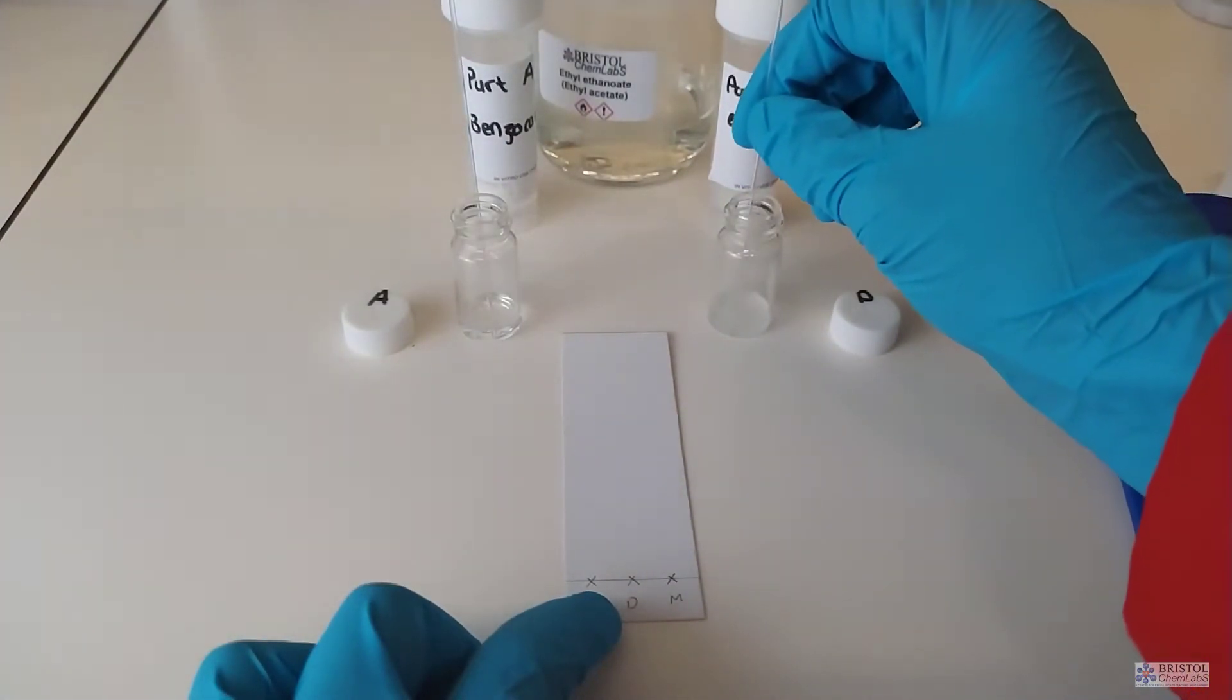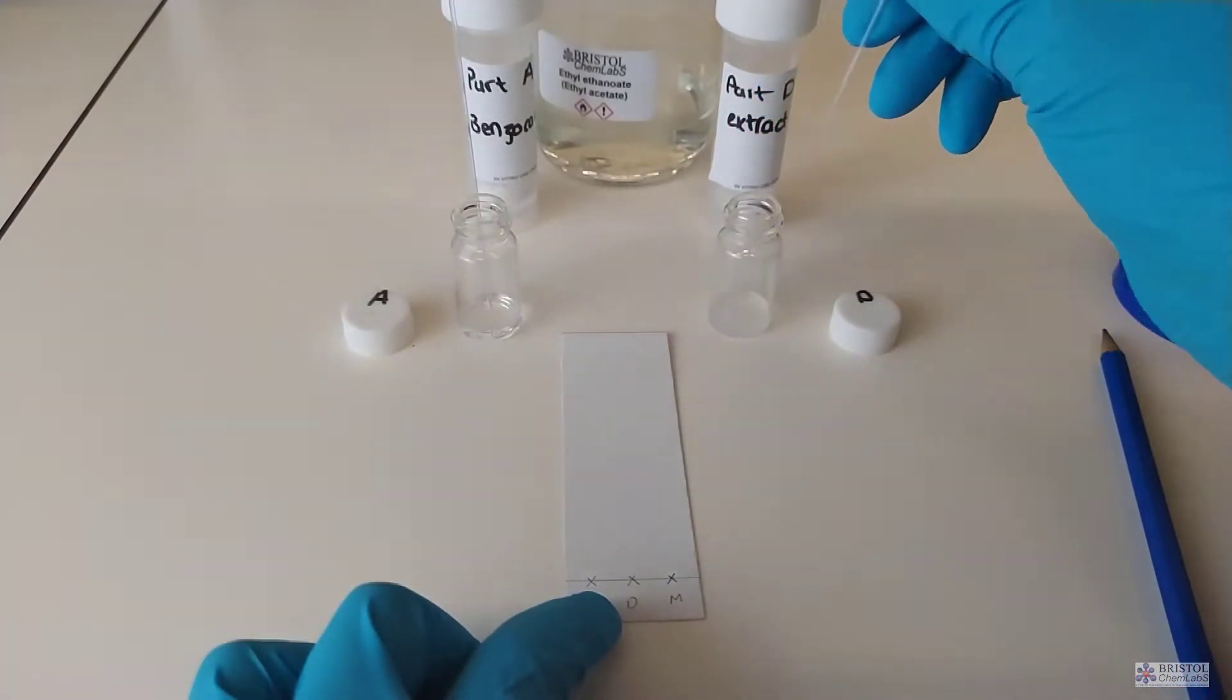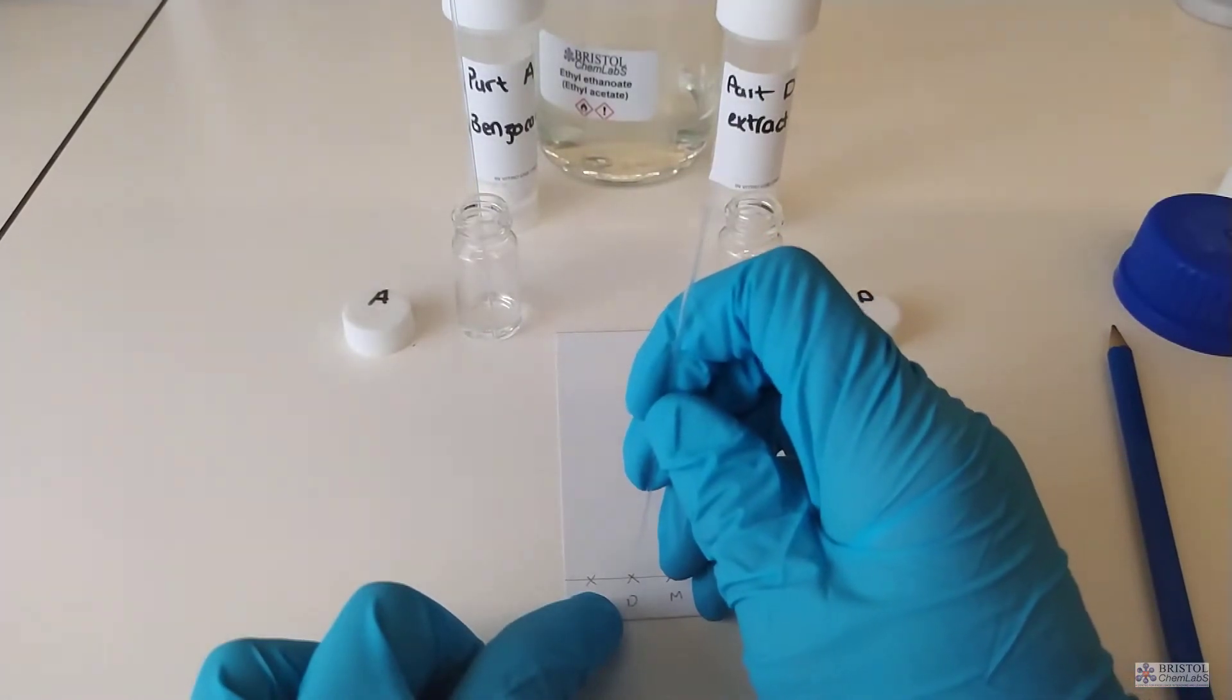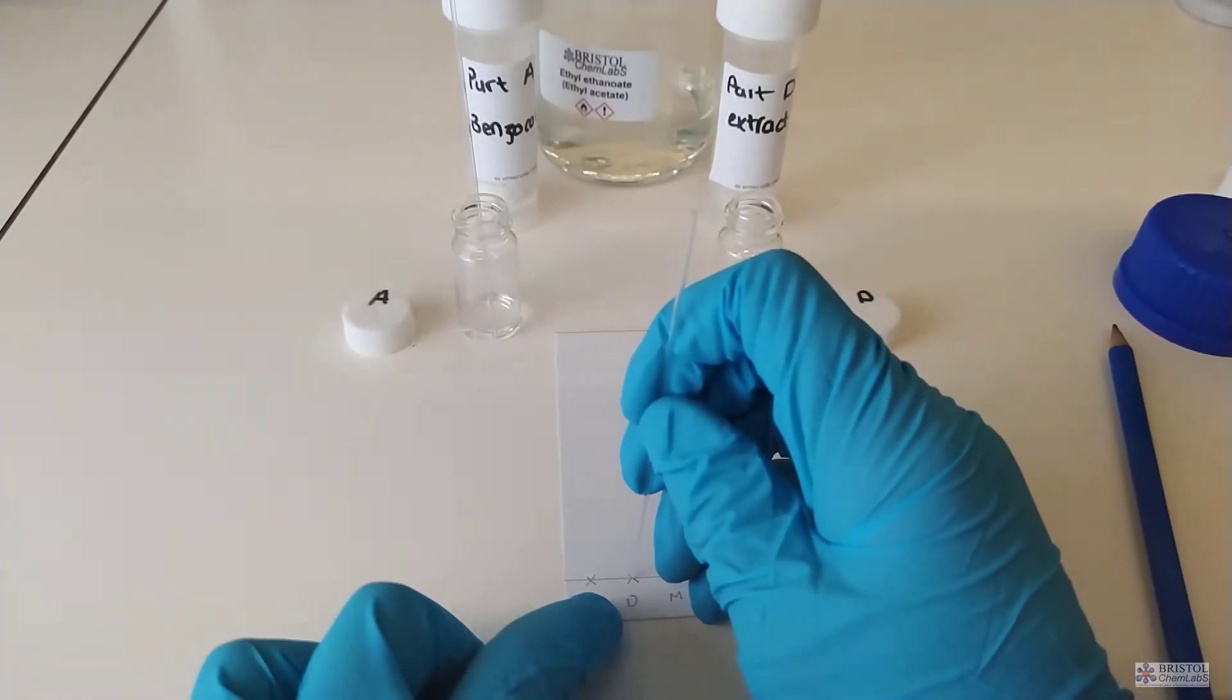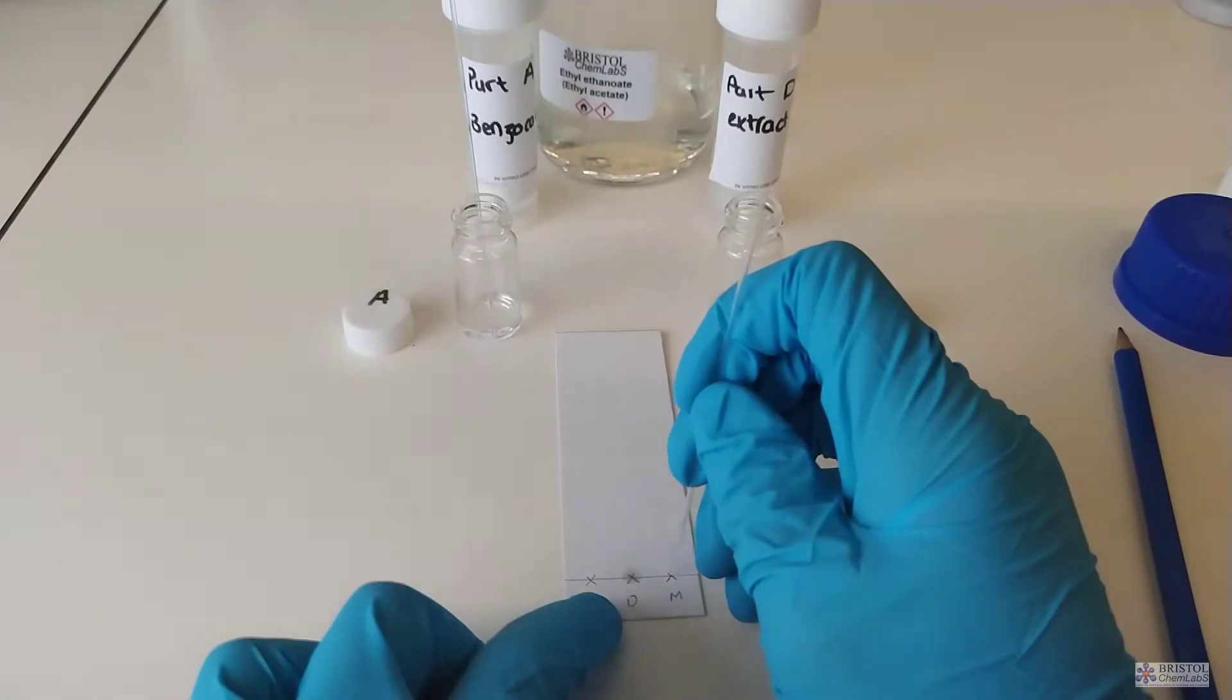Before we run the TLC we put the plate under an ultraviolet light. Because the sample applied has covered over the fluoresce it appears as a dark spot against a green fluorescent background. You can also check there are no impurities elsewhere on the plate at this point.